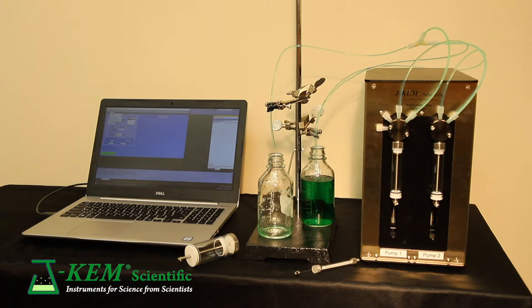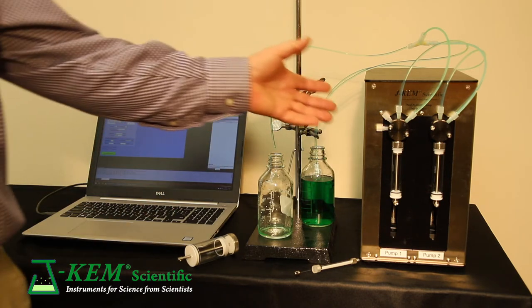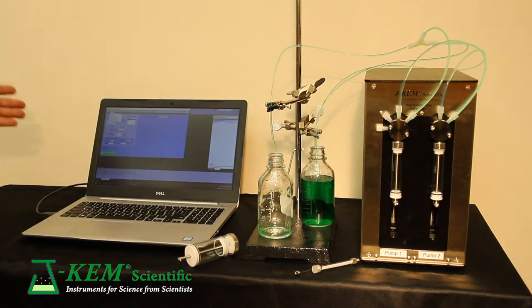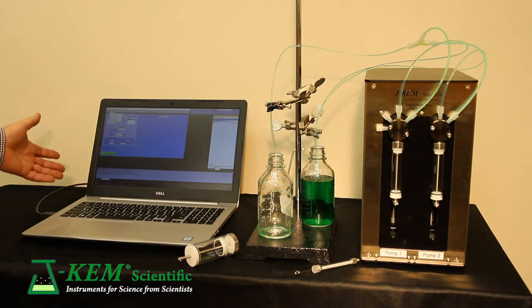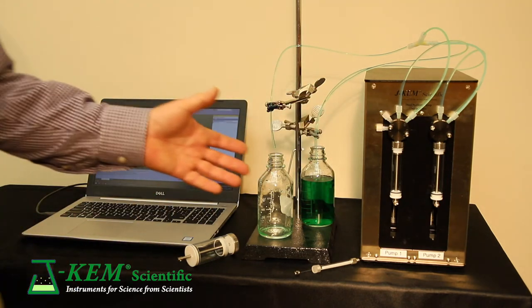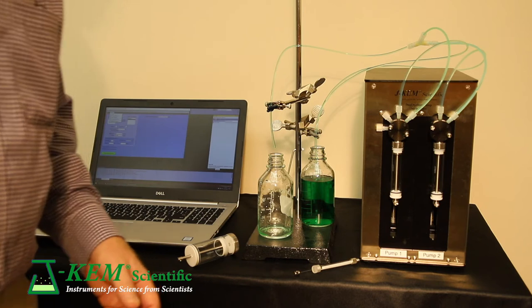The system consists of two parts. There's the hardware components of the pump itself and then there's the software components, but I'm going to start with the hardware components first.